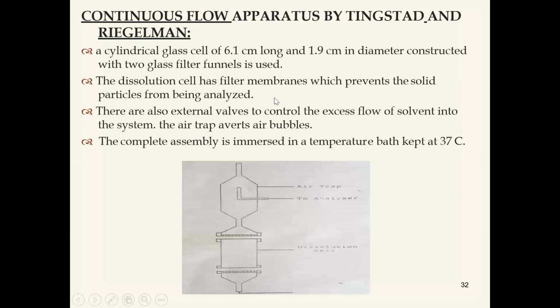Next one, continuous flow apparatus by Tingstad and Riegelman. This consists of a glass cell that is 6.1 centimeters long and 1.9 centimeters in diameter.